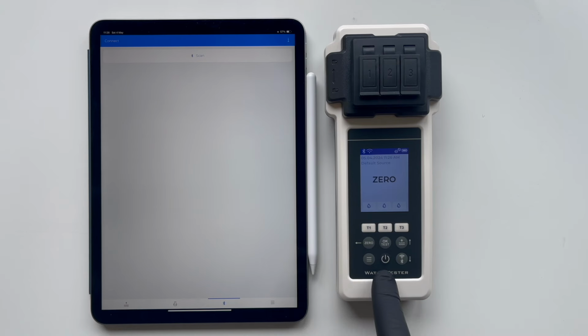Essentially, after this step, once you've updated the device, you can use the tester autonomously to conduct analyses and receive results. It's fully functional. However, to utilize the full functionality, receive advice, dosage recommendations, and so on, continue watching this video. We will show you how to use the PoolWaterLAB tester.